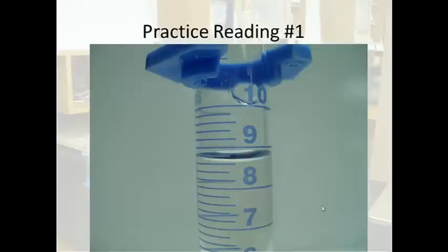All right. I'm going to walk you through it. Here's 8, here's 9. These look like they're 0.2 milliliter increments. So that's 8.2, 8.4, 8.6, 8.8. So if this is 8.8 and this is 8.6 down here, it looks like it's a little bit closer to 8.6 than it is to 8.8. So I'm probably going to say it's 8.65 milliliters. Okay. Notice I don't think it's exactly in between.